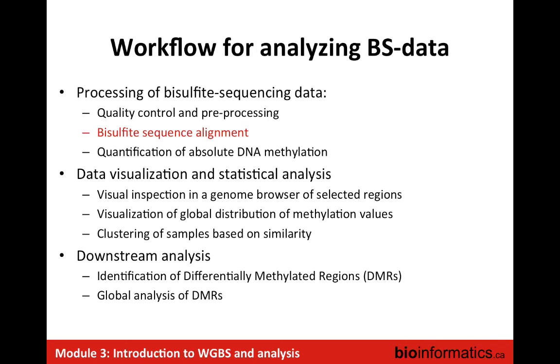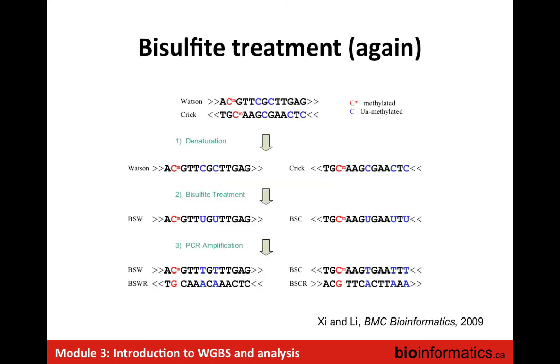So now we're going to get to the fun part, which is really the bisulfite sequence alignment. And the fun part is once we get to the variants, but that's after. You'll see that it's already fun when we talk about the alignment of these reads. So this is a similar slide to what I showed you when I explained the bisulfite treatment in the beginning. Usually if I haven't had my coffee, I get confused when I start thinking about this alignment.